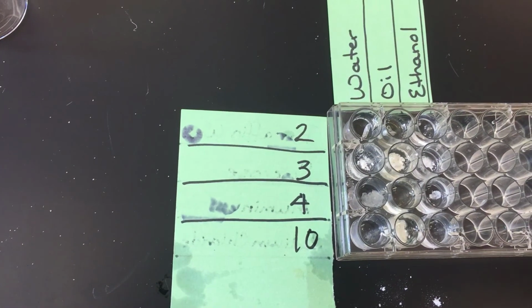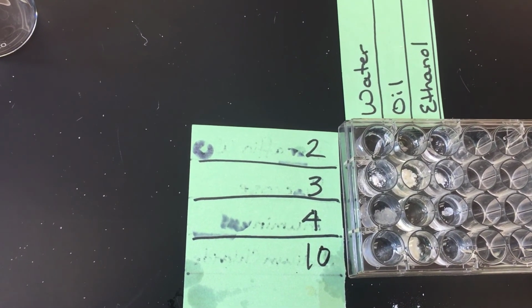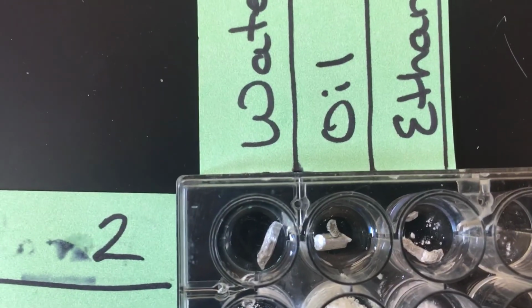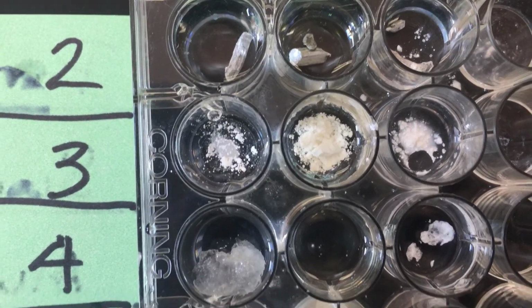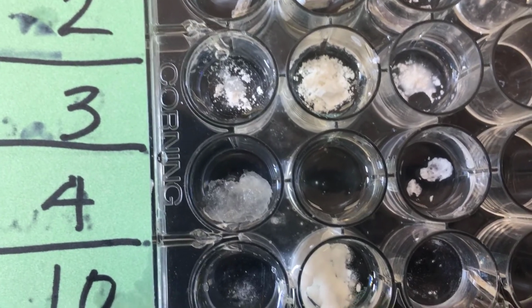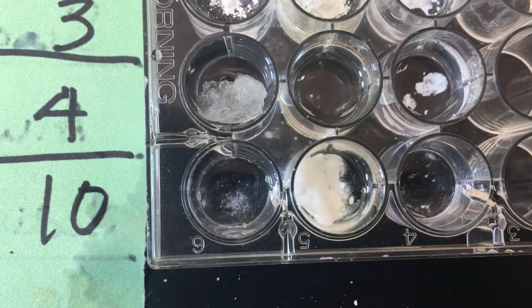Okay, so now we have run our solubility in water, oil, and ethyl alcohol test for all 4 of your unknowns. And if we look at them, and you'll have the chance to examine it more closely, but remember what you're looking for is when the substance is no longer visible, that indicates that it has dissolved. When the substance is clearly visible, that indicates it has not dissolved. And just to add to your understanding, I put approximately the same amount of substance in each of the wells, so it's possible that you have a partial dissolving as well.